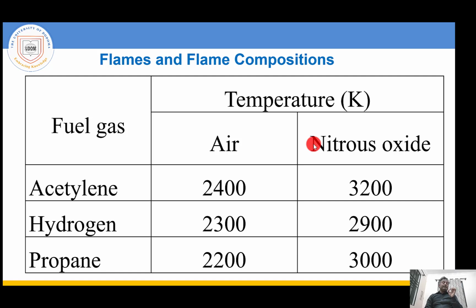The very high temperature is very important in order to efficiently atomize the solution. So, the sensitivity and accuracy of the result mainly depends on the temperature of the flame. That's why we have different options in order to produce the flame.